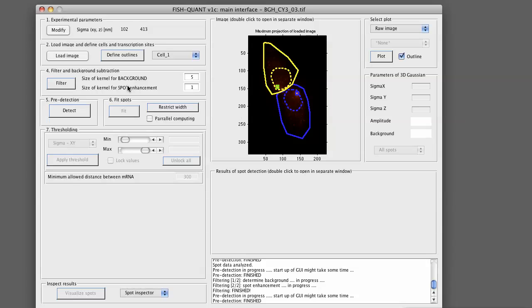The resulting image will then be convolved with a small Gaussian kernel to enhance spot-like features. The size of this kernel is expressed with a multiplicative factor of the theoretical size of the PSF that has been determined based on the experimental parameters.